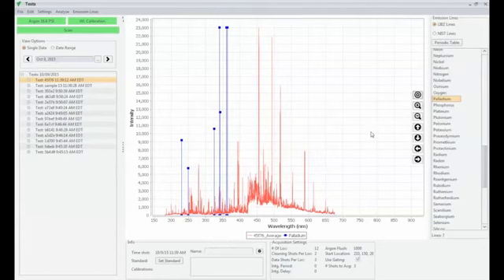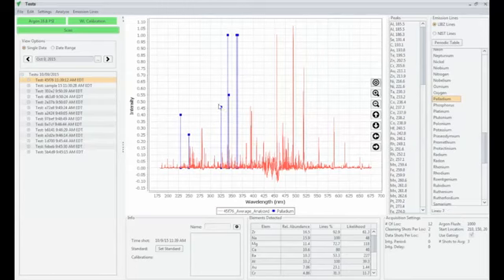We talked about if you know a specific element that you want to look for in your spectrum, you can use our LIBS lines library to identify where the peaks should show up and then go look for those peaks. Another way to do this would be, we have a spectrum, we want to know what's in it, by going to this Analyze menu, and we'll hit Analyze Spectrum. What this does is it actually searches the entire spectrum and will find peaks based on the different peaks that it finds. It's going to search through our LIBS line library and identify the elements it's confident are in the spectrum. So that's what we see down here in the bottom. We have a list of elements that have been detected.